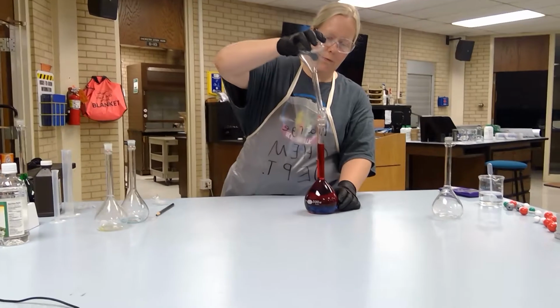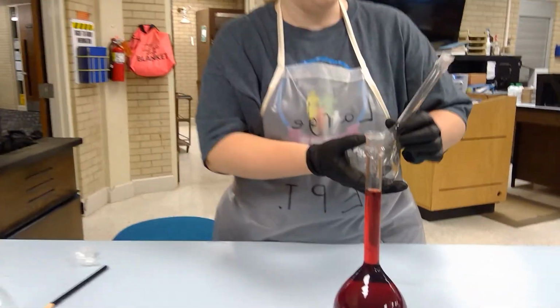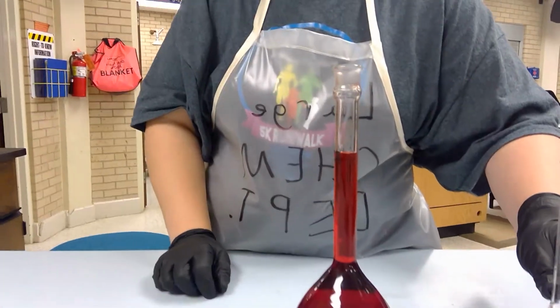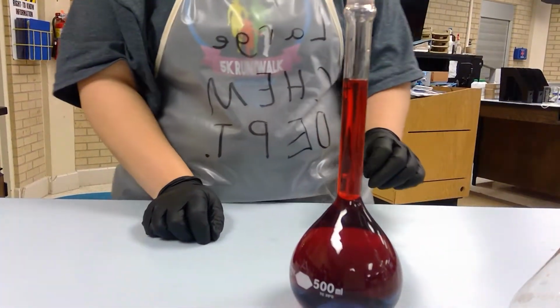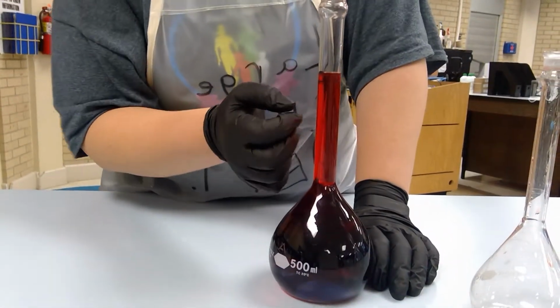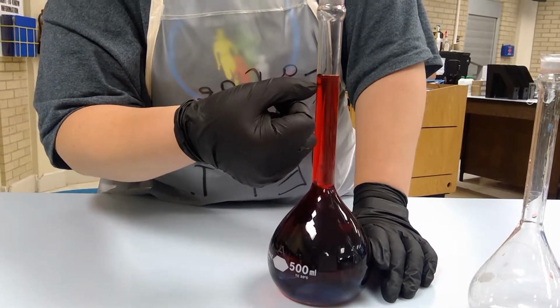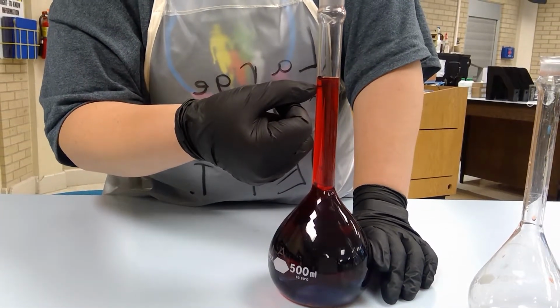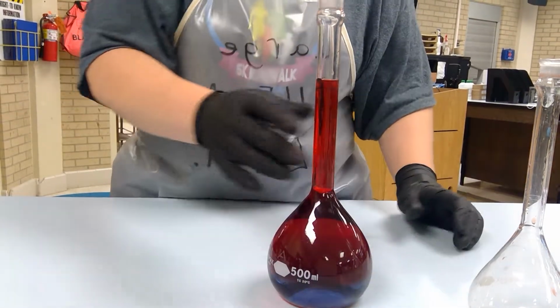If you look very, very closely, I have mixed these two solutions, the red and blue, both of which were originally 250 milliliter solutions. They should add up to 500 milliliters, which would be this black line right here. But you notice, by me mixing those two, I had the opposite effect.